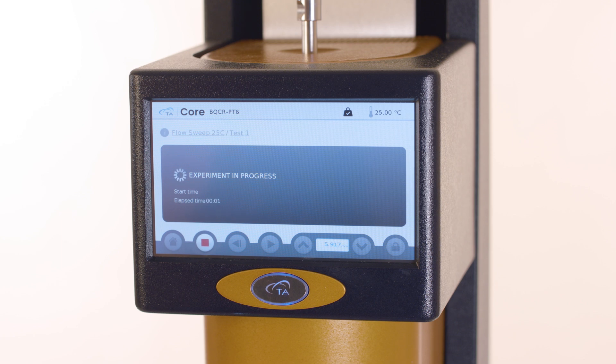The touchscreen displays experiment in progress, the start time, and the elapsed time while the experiment is running.